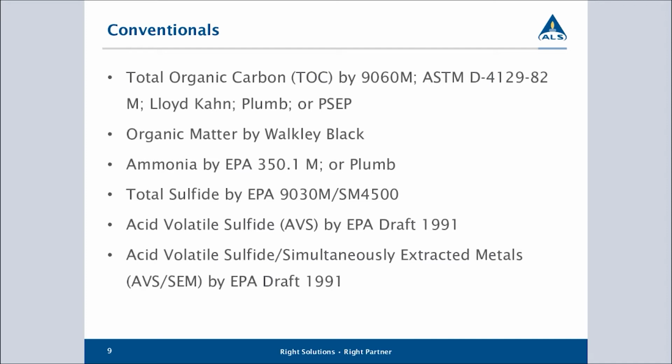Here we offer a lot of conventional tests that are run on sediments. Most common ones would be total organic carbon. We do a couple different tests, a high temperature dry combustion, and various methods in between. We also offer a Walkley-Black, where oxidation occurs using a dichromate oxidation procedure.